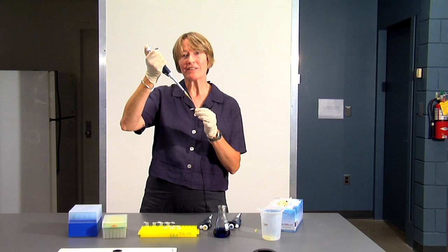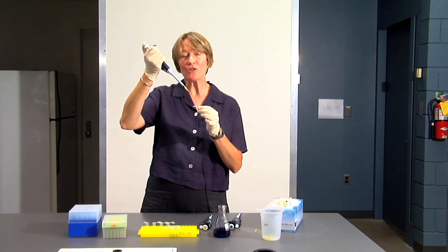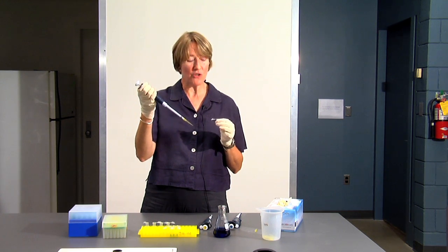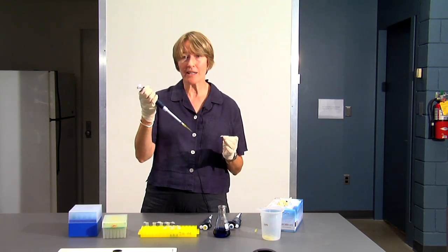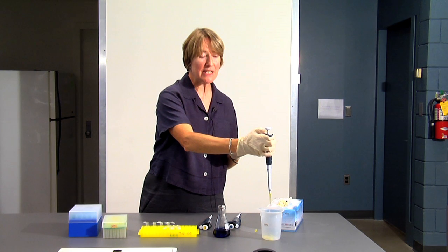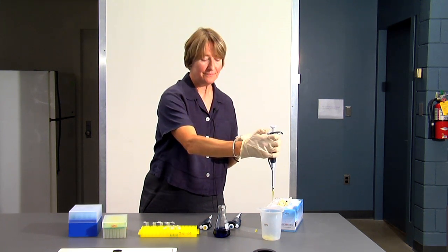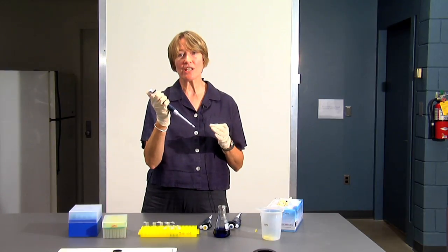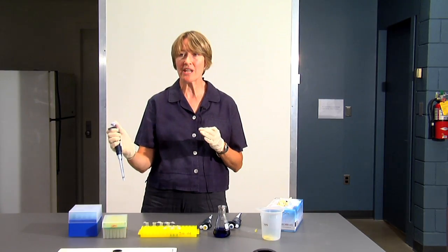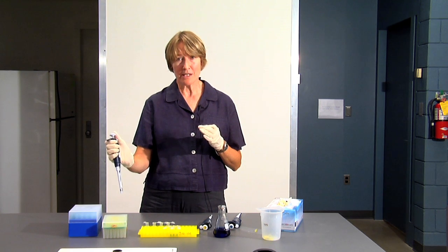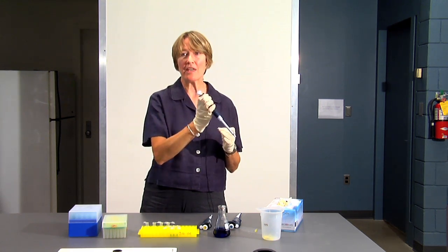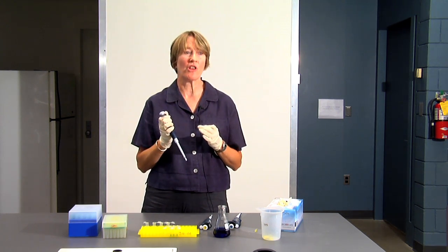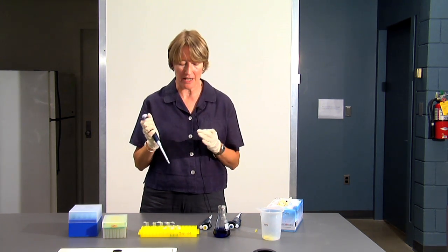When you've finished adding your solution to the tube, you will eject the tip into the waste bucket by pressing down on the tip ejector. This way you never actually have to touch the tip from the time that you take it out of the tip box until the time that you have finished your pipetting. And that way if you're working with toxic chemicals or bacteriologicals, you're not going to contaminate anything.